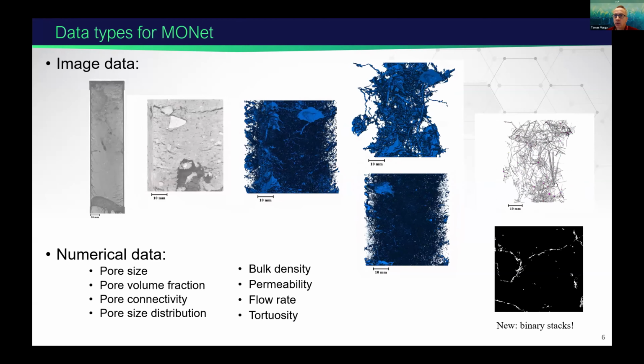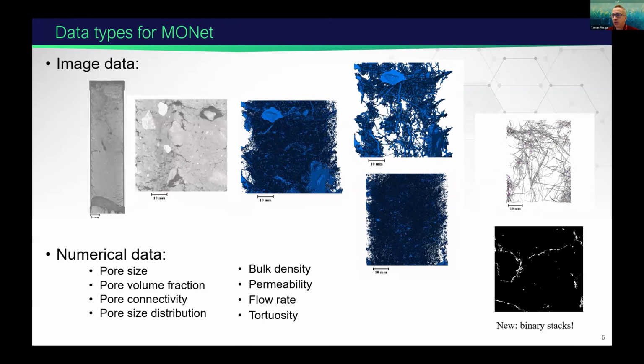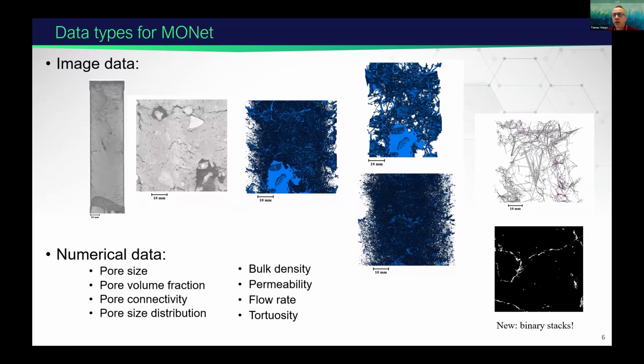So basically 3 image stacks are also added that can be opened, and so you can actually visualize the pores for yourself.